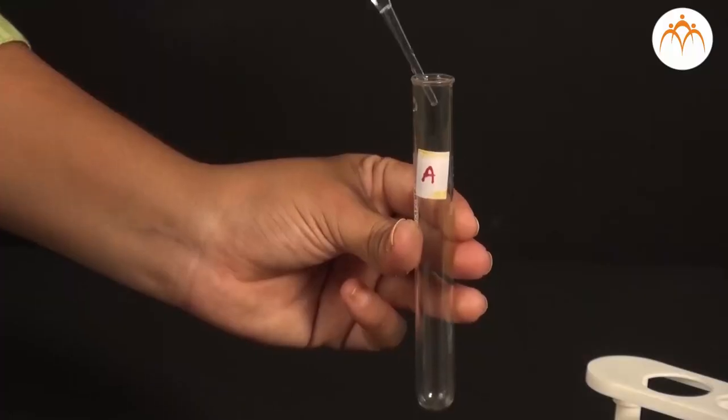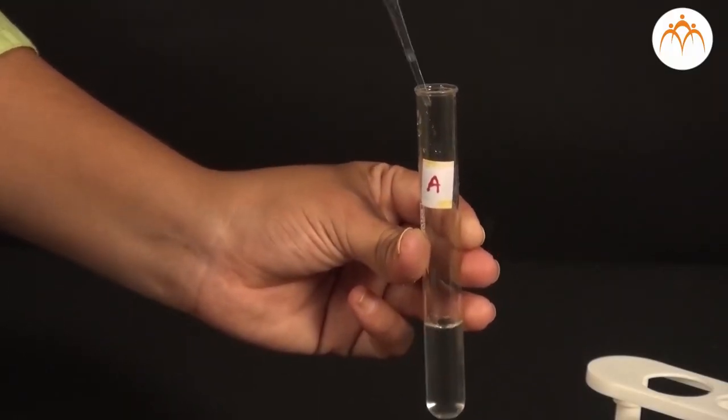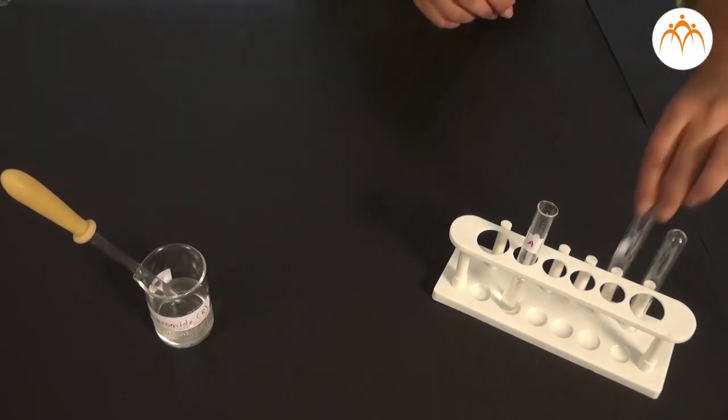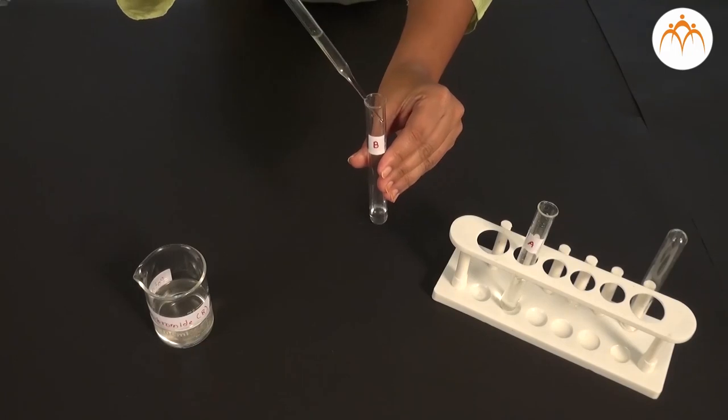Which test tube contains chloride, which test tube contains bromide and which test tube contains iodide? We keep these test tubes A, B and C on the test tube stand and add a few drops of silver nitrate to these three test tubes.